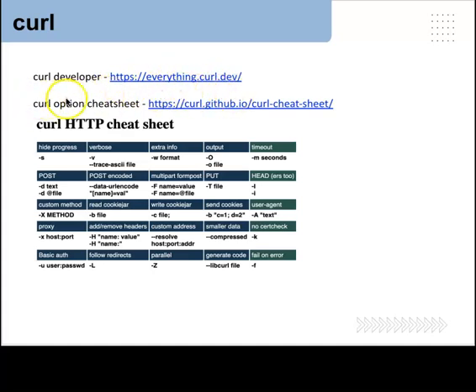And I found this cheat sheet on this GitHub right here. So we're using two arguments, the argument -L, which is going to follow the redirect, so follow the FTP link that's provided, and then -O for output. So this is going to be the output file name that we will want to place into our raw directory.